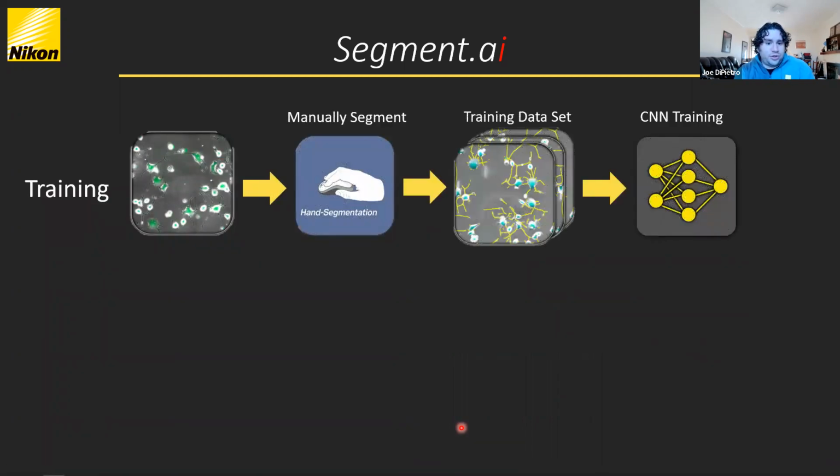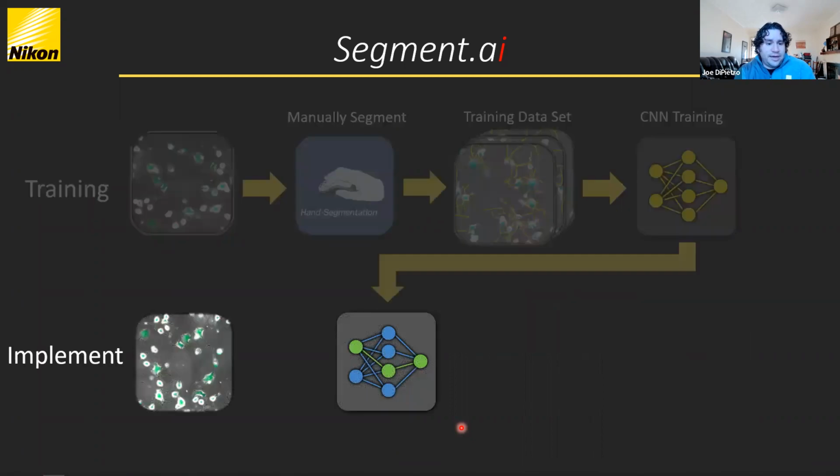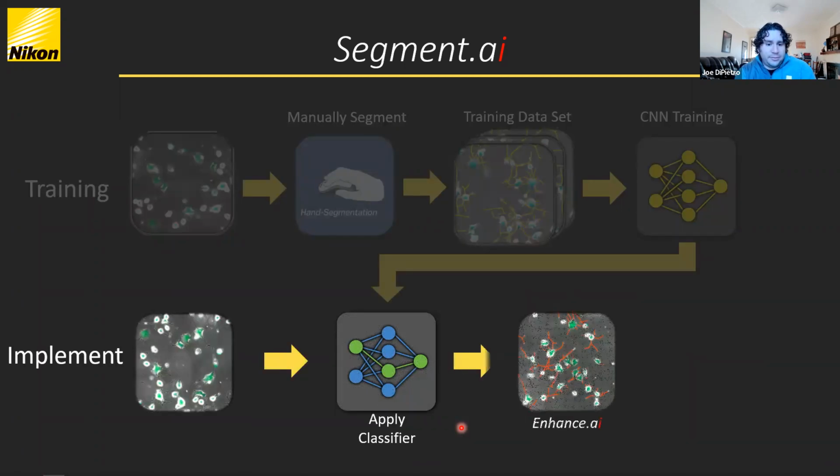Hand segment, train, get a classifier, implement. Now you have it.